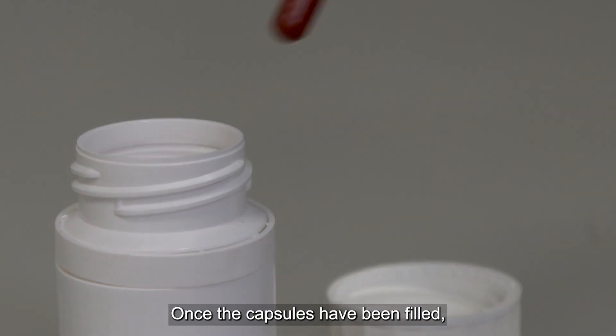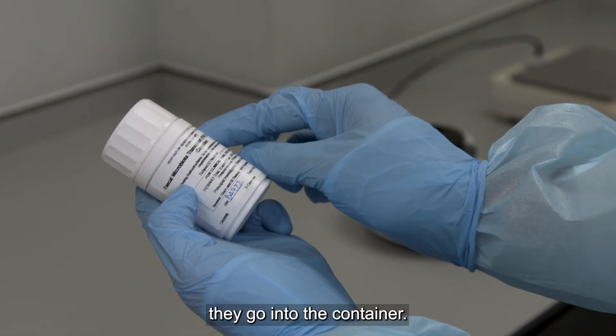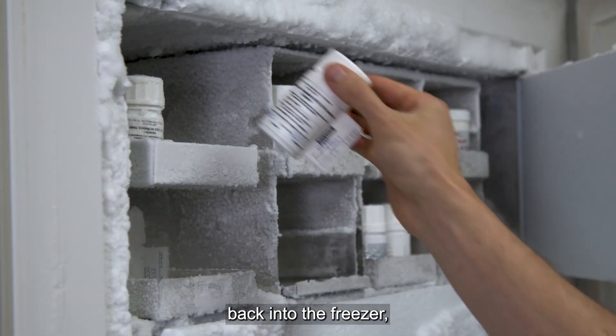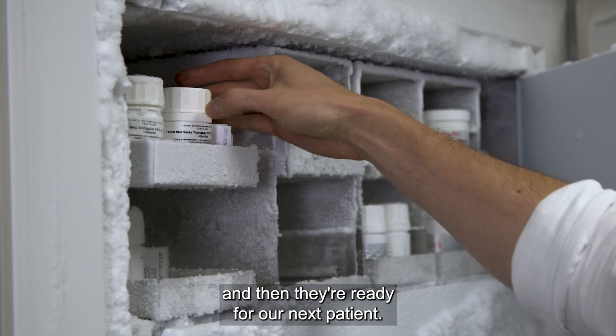Once the capsules have been filled, they go into a container, they're labelled so we know exactly where they came from, back into the freezer, and then they're ready for our next patient.